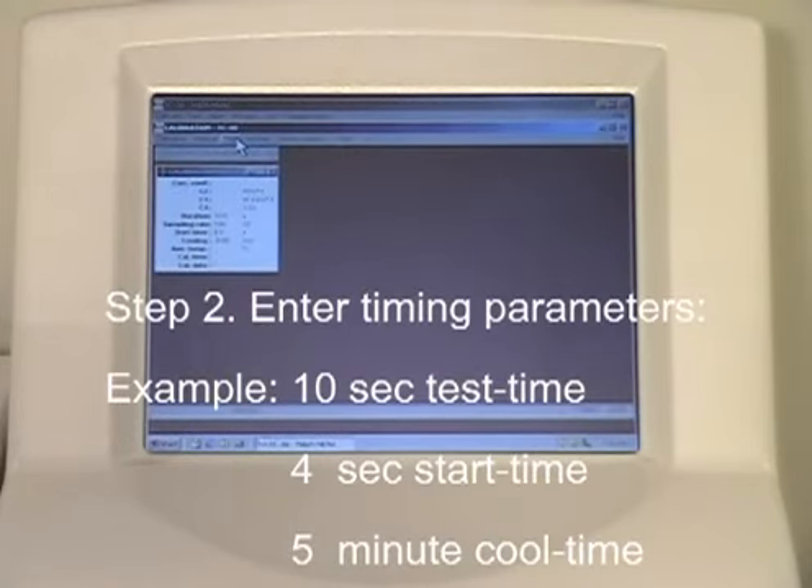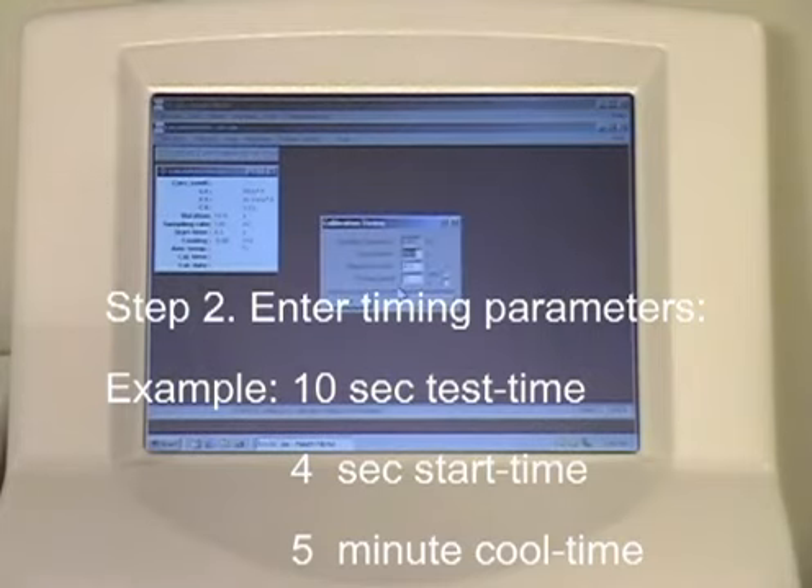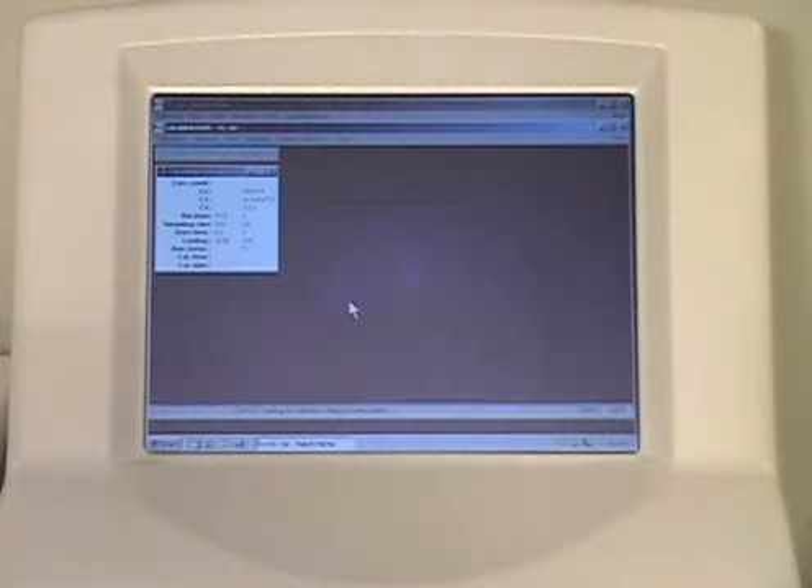Step 2. Enter the timing parameters you will use to test your samples. In this example, we did a 10-second test time with a 4-second start time and a 5-minute cool time, which is to allow the reference materials to reach isothermal conditions between each test.